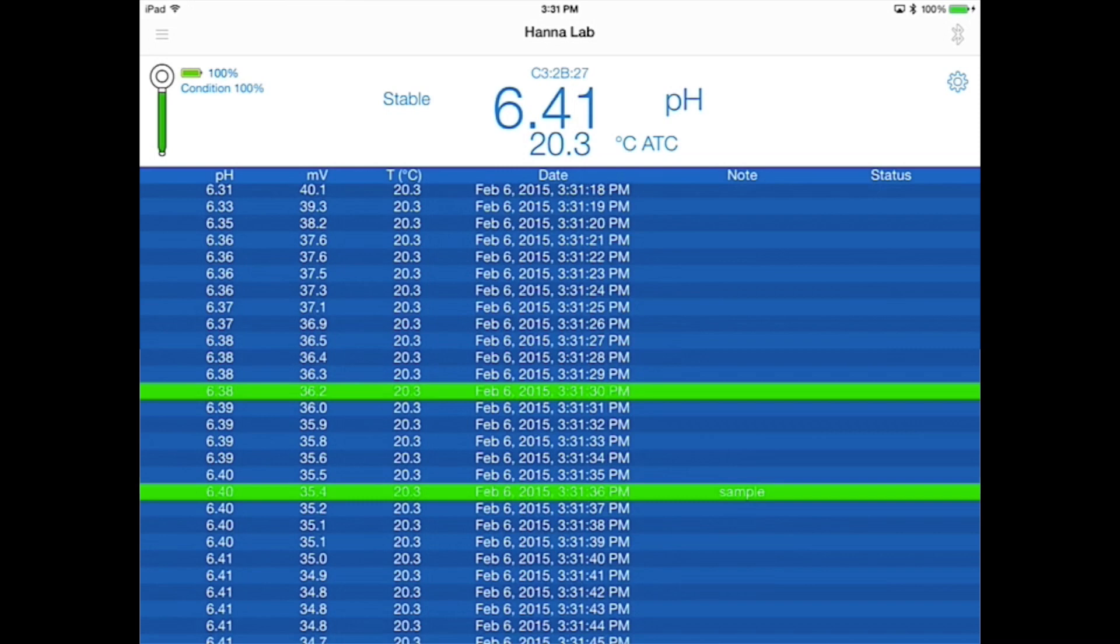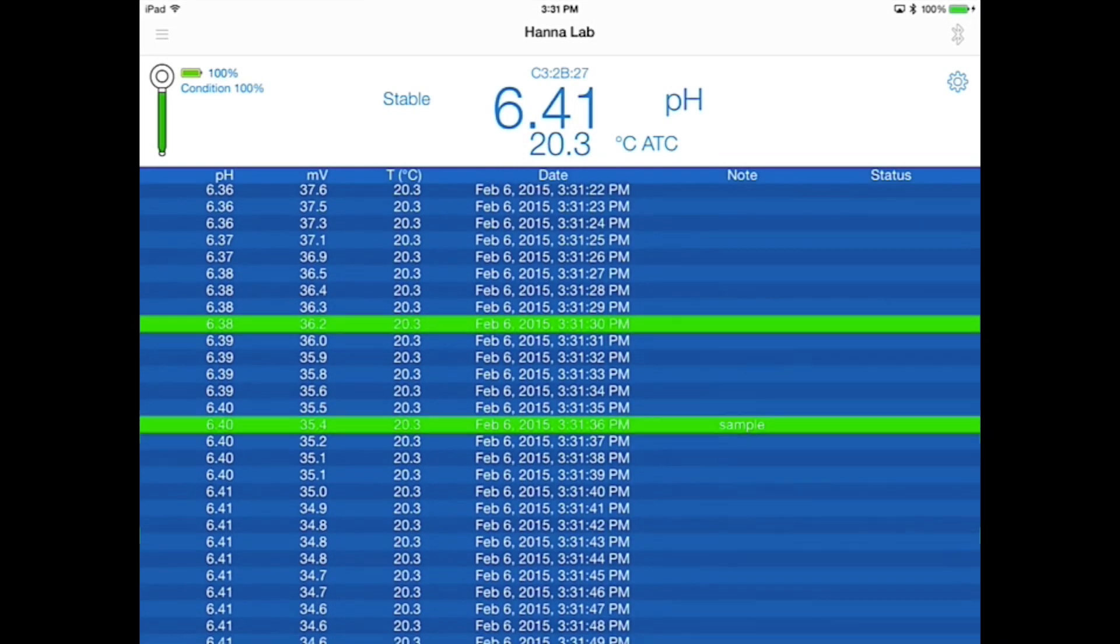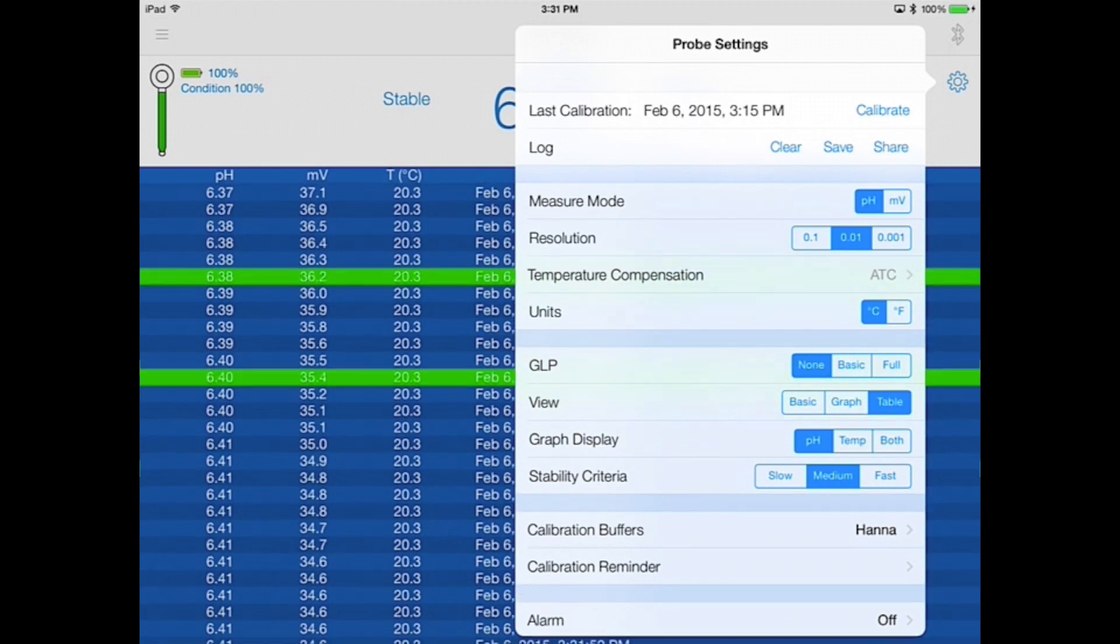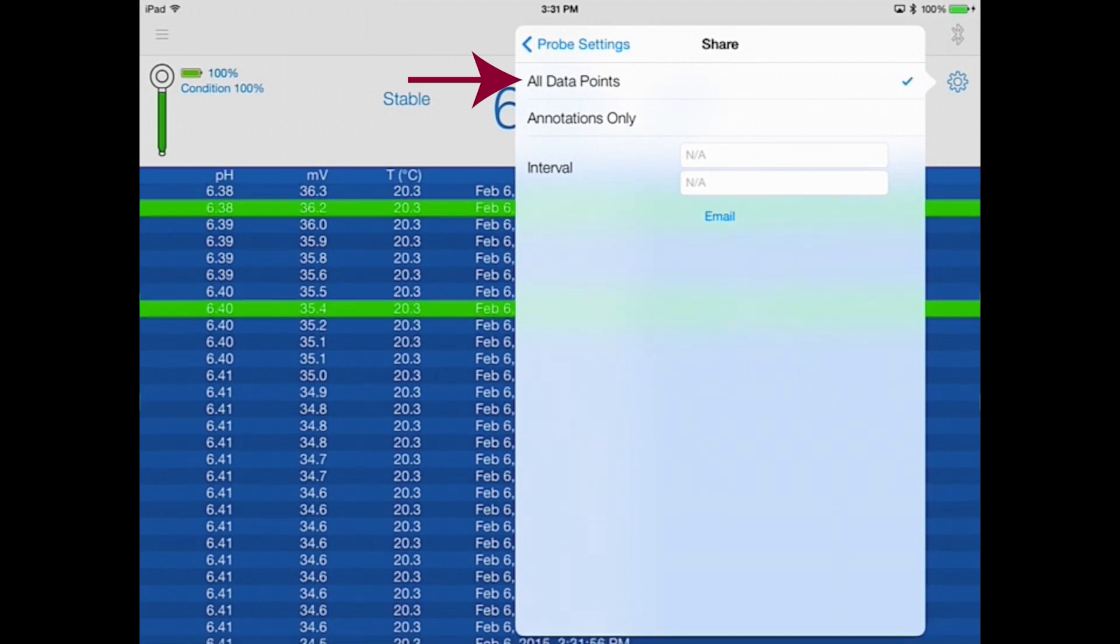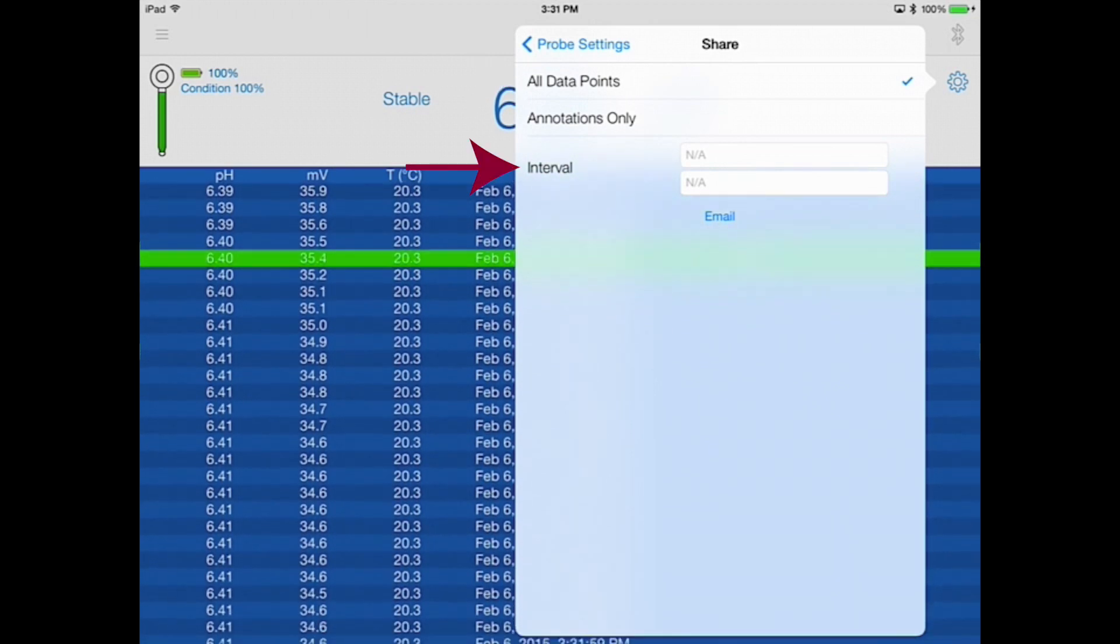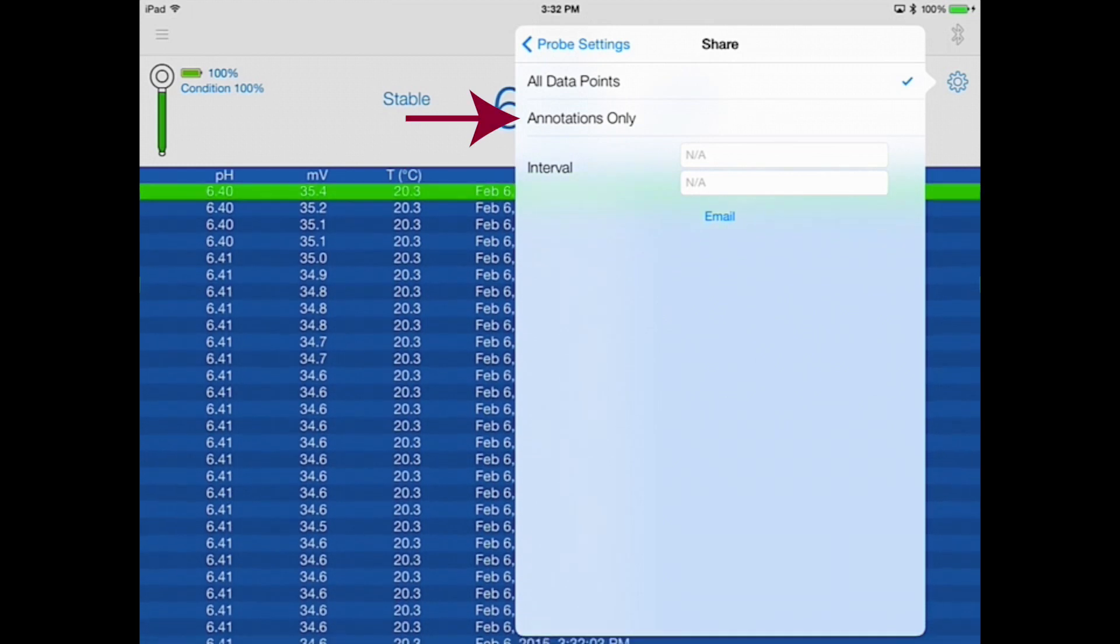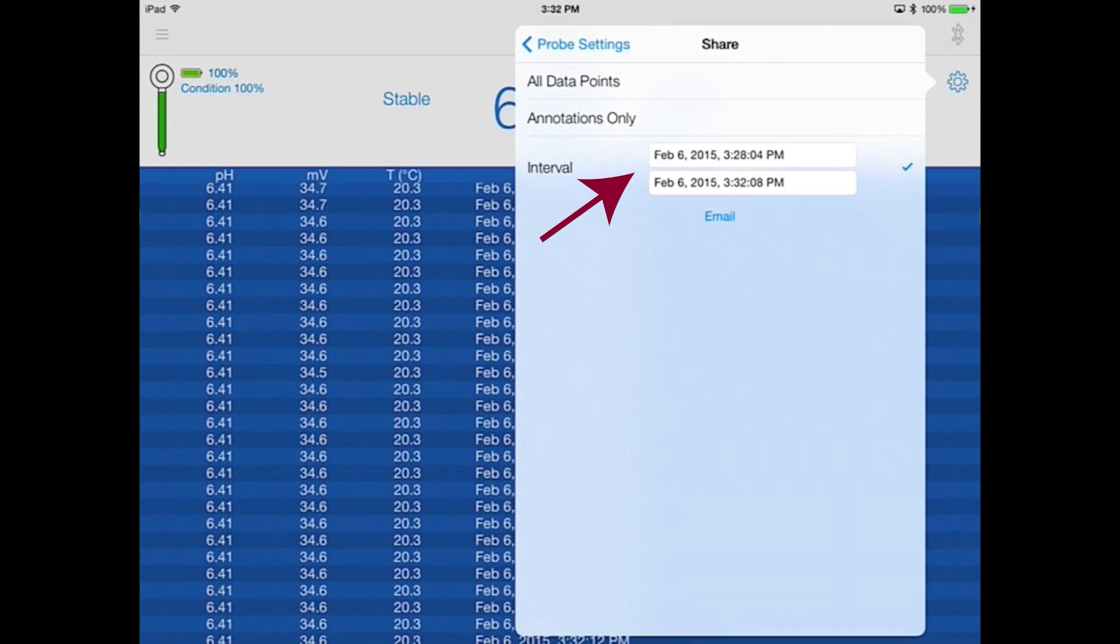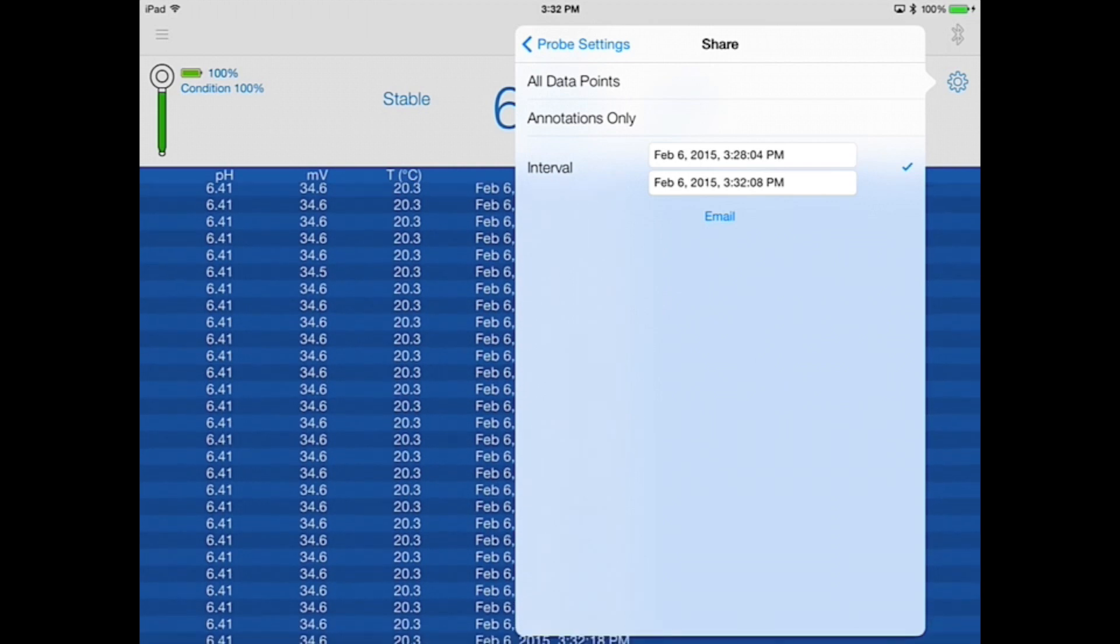You may also save or share measurements by tapping the gear icon and electing to save or share your data. Here you have the option to save or share all data points from the log, all data points over a specific interval, only annotated points, or only annotated points over a specific time interval. The shared log files are exported as CSV files and are sent by your iPad's default email program.